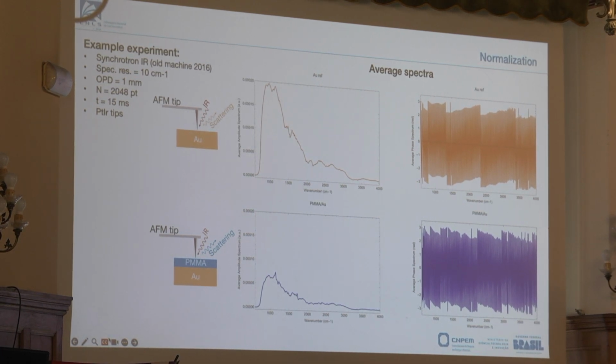They come because if you show the interferogram, the white light position is in the middle of this window, and the origin of this window is to the left side, right? So the interferogram is in the center. If NeoSpec would directly in the software put the center at the white light position, then all these phase ramps would vanish, and you would see, even without any normalization, the phase spectrum. So it's a very simple thing, and you would see online, without normalizing, immediately the response of the sample. So, NeoSpec guys, where are they? That is really powerful, and we had a lot of discussions lately in the group, because in principle it's unneeded to look at this data that way.